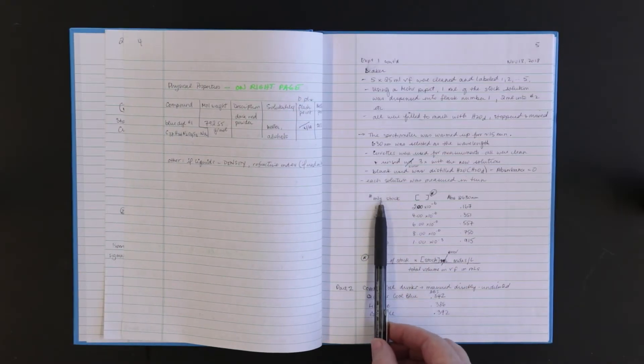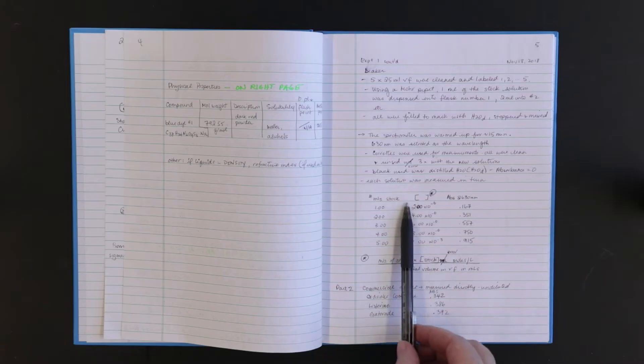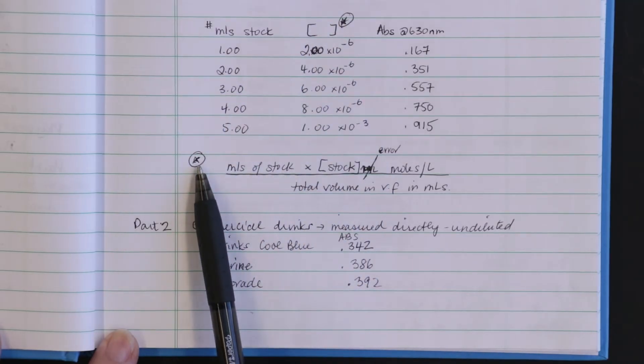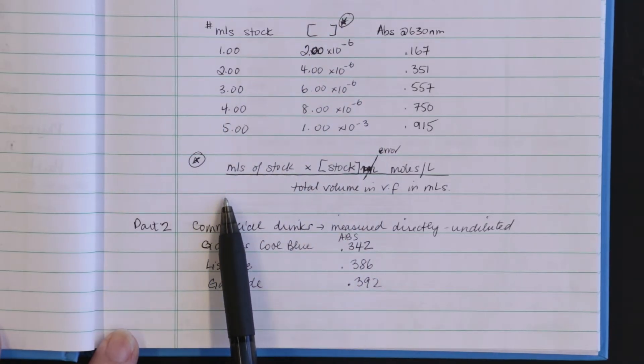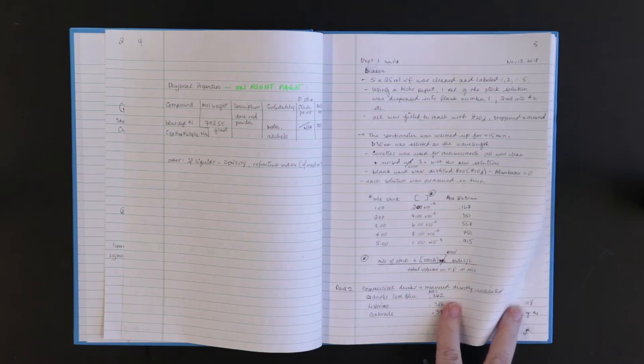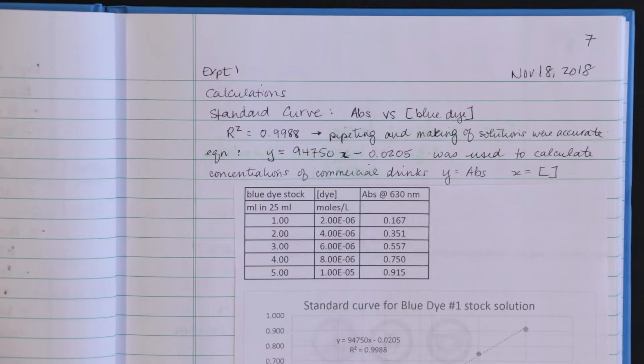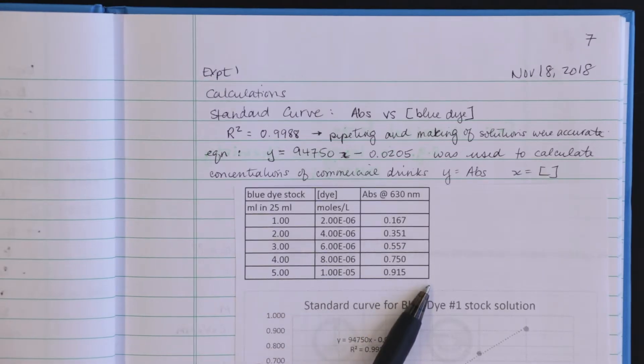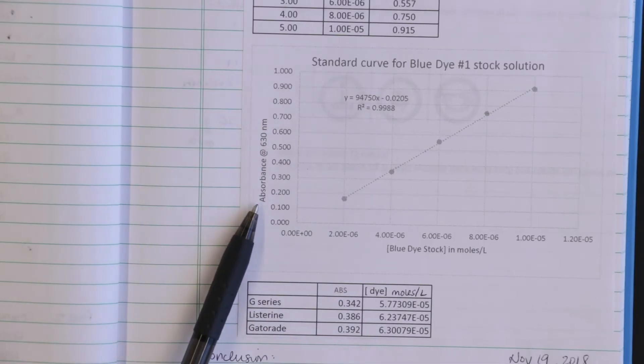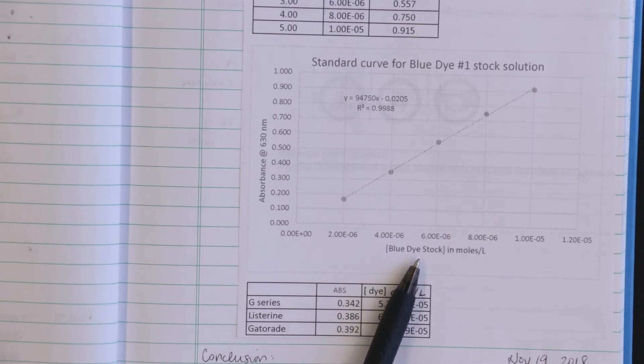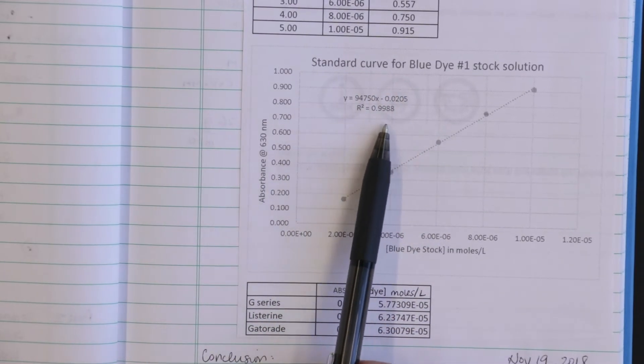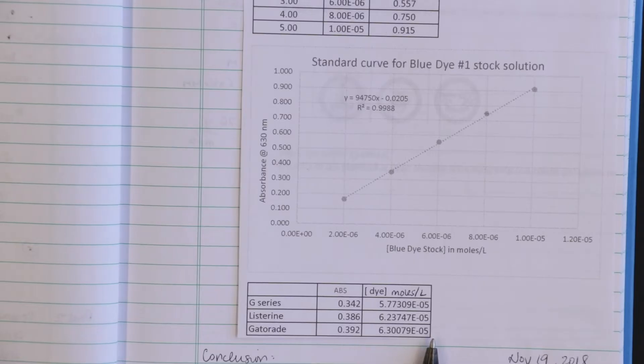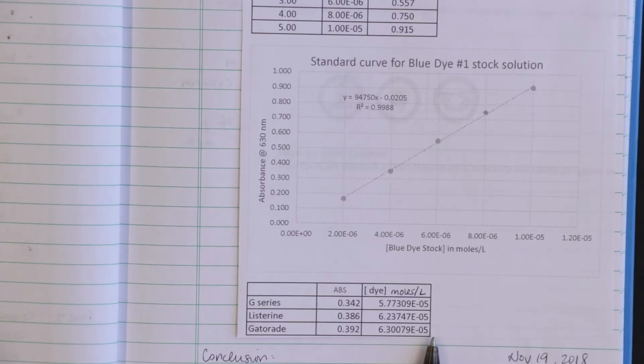Continue the procedure and results on the next right page. Here we have the number of mils of stock solution, the calculated concentration, and the absorbance values measured. By the concentration I have a star. This takes me down to how I calculated the concentrations. When doing a calculation use symbols or words rather than numbers and always show your units. This is the results, calculations, analysis, and graph section. In this case I printed out my data on Excel with my standard curve graph. It is absorbance versus concentration and I get my line equation and my R squared. This value represents how close my points are to the best fit line. It is best to glue or tape this into your notebook. All of this must be in your notebook first and then transferred or copied onto your report sheet.